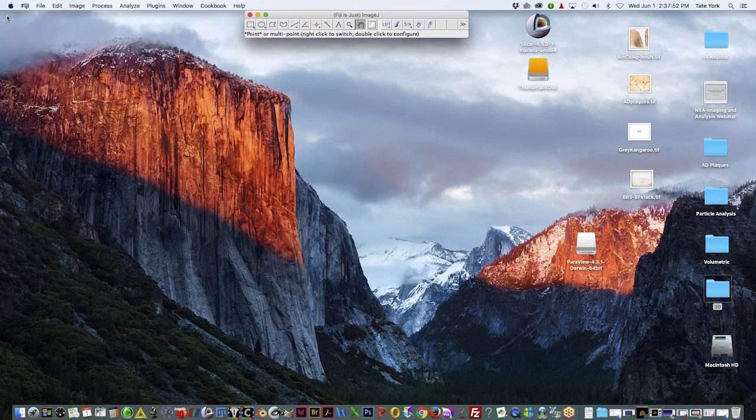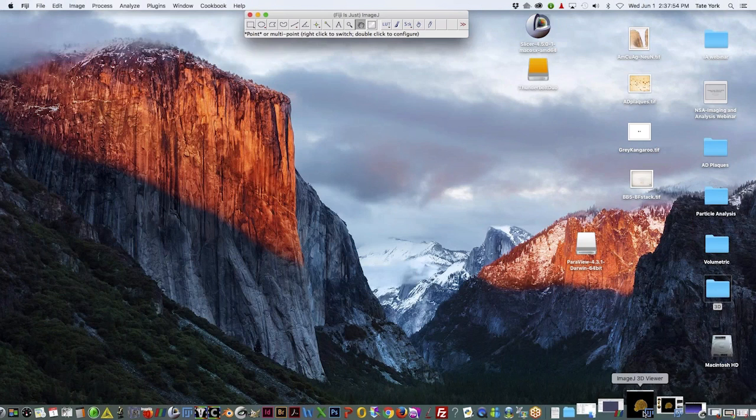And so just like we did with the block face images, we can upload this as well into Volume Viewer. And I actually just want to show one more thing before we move to that.